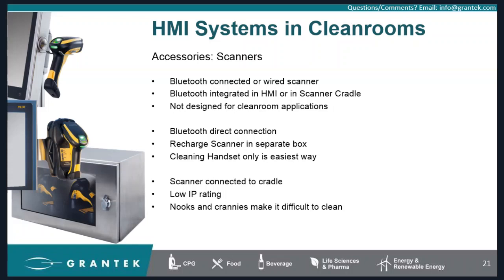You have issues with really cleaning all the nooks and crannies in there. And again, a solution would be to put it into a separate box. That way the scanner cradle is not collecting any dust, not really posing an issue to the clean room.